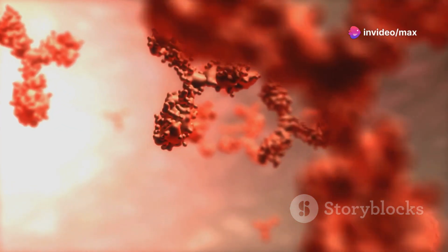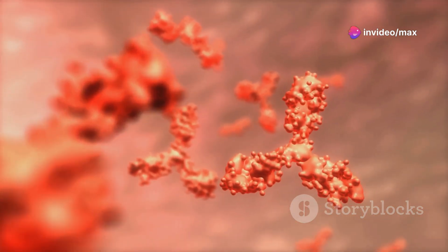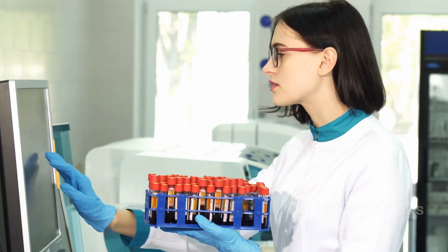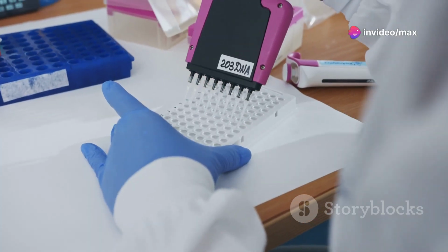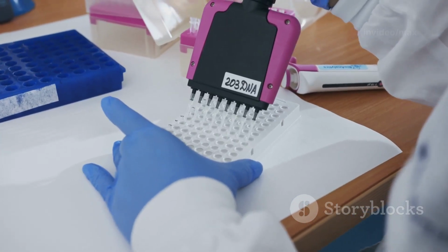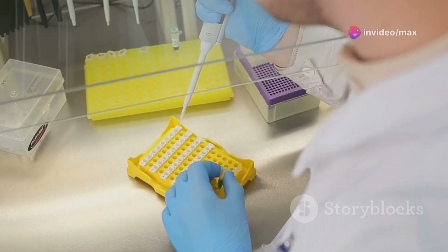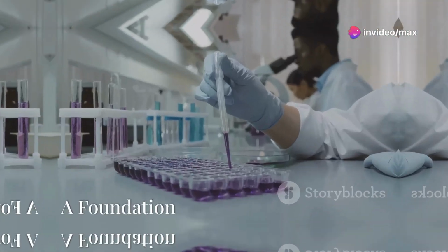ELISA relies on the remarkable ability of antibodies to bind specifically to their target antigens, much like a lock and key. This powerful technique comes in various flavors, each with its unique strengths. We'll be focusing on two popular ELISA methods: sandwich ELISA and competitive ELISA. But first, let's quickly recap the basics of direct and indirect ELISA, which lay the groundwork for these advanced techniques.